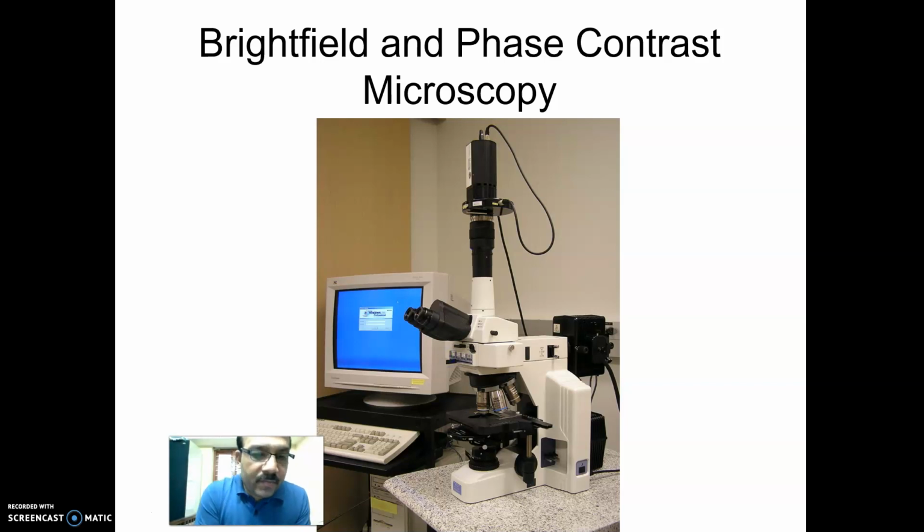So today we are moving to the most important microscope, which is regularly asked in the examination. The first one is the phase contrast microscope. What is actually phase contrast? The term itself indicates that it provides a contrast within the phase without the utilization of any stain. Most of the specimens are observed without stain.